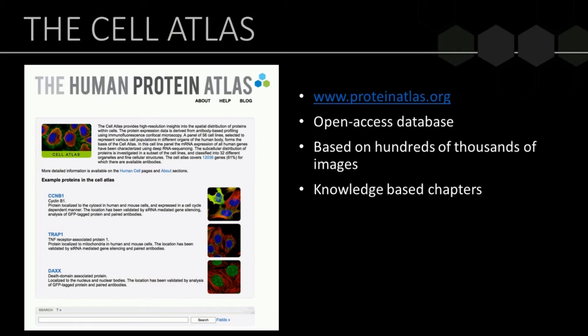So the Cell Atlas, this is the starting page of the Cell Atlas, can be found at proteinatlas.org. It's an open access database based on hundreds of thousands of images. And we have these knowledge-based chapters. But you can also, of course, search for your protein of interest, any gene in this atlas, and then you can just type it into the text box below here. And I will show you an example of cyclin B1 just to illustrate the data that we have in the atlas and what it looks like.